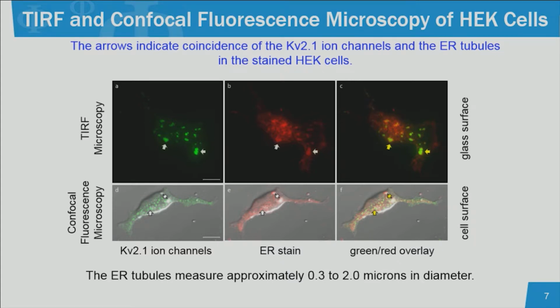And the ER tubules are measured here to be between 300 nanometers and 2 microns in diameter, which is well within the range of resolution for TOF-SIMS imaging.